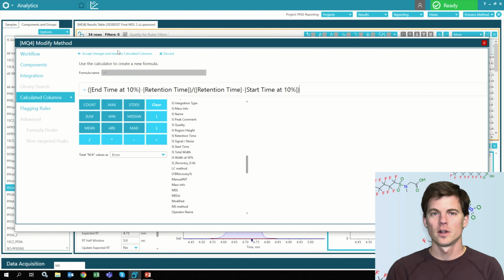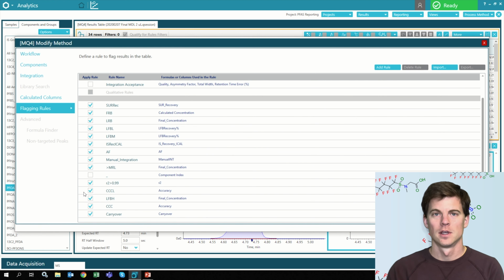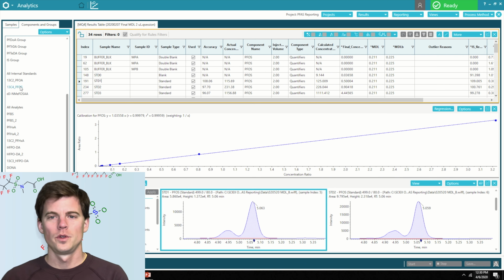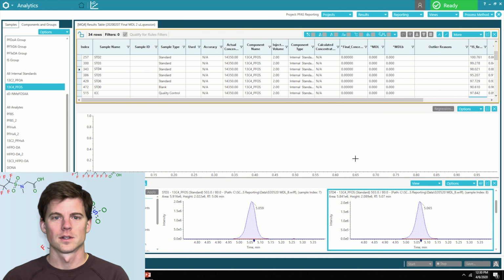And it's smart enough to give you options to only flag those first two eluting compounds, which is nice. You don't have to flag all the other ones. And you can only flag it in the midpoint standard. Those are all options here. So here you would review your curves. I'm just kind of showing what the software looks like, what the peaks look like.